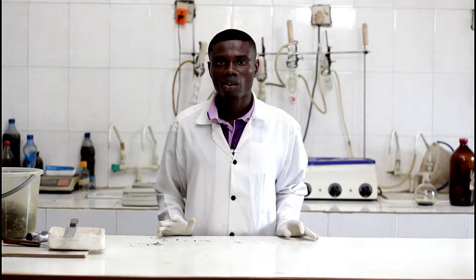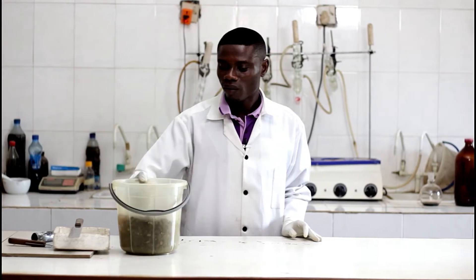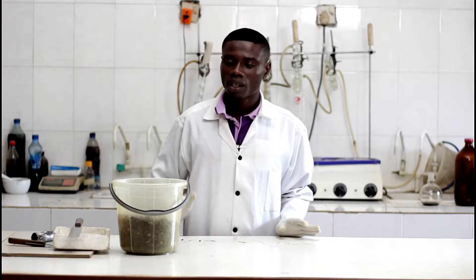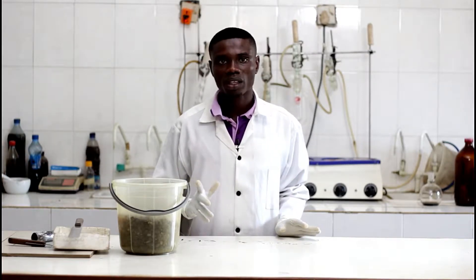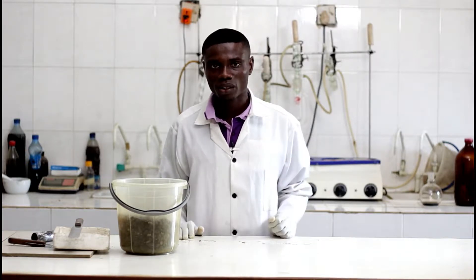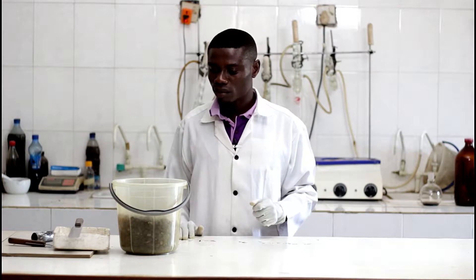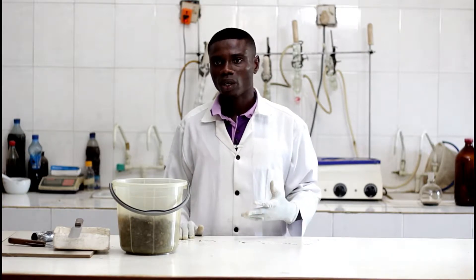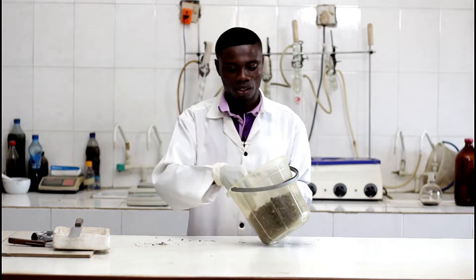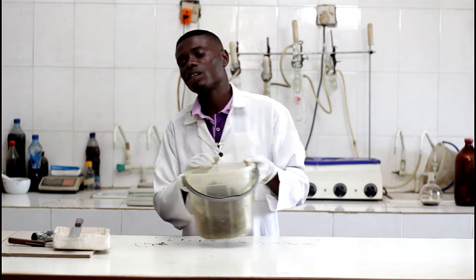This is the Quality Control Unit of Agro-Ideas International Limited. My name is Ididion Jack, and I'll be taking you on what we do here in the laboratory. Since our major material is palm kernels, I'll be taking you on the four tests involved: number one is the shell contents, moisture contents, oil contents, and free fatty acids.